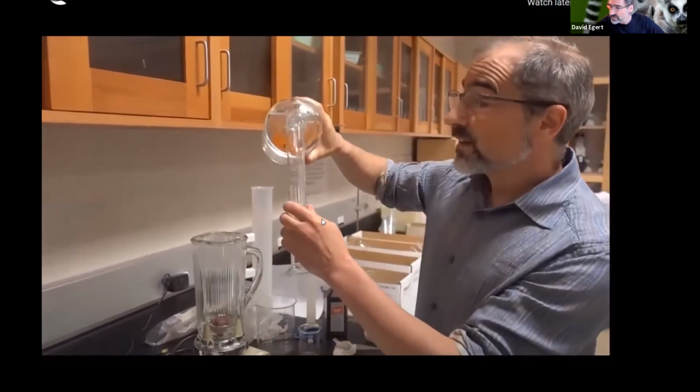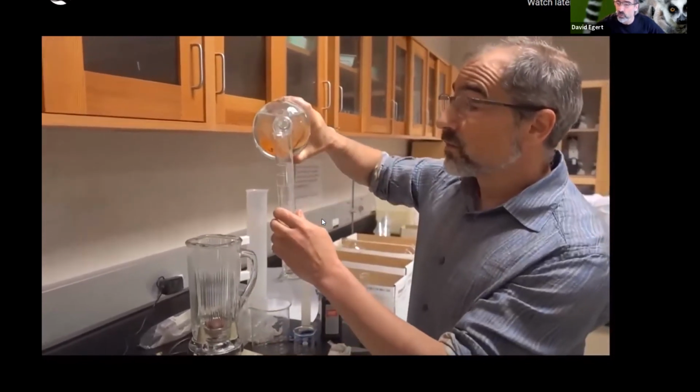And again, why am I making the solution with phosphate buffer instead of with just water or something? So that it'll stay at a constant?